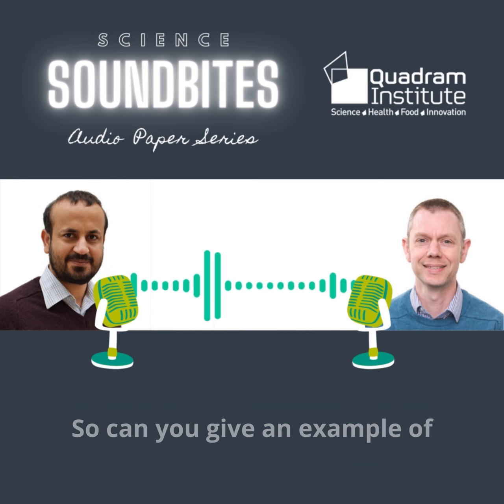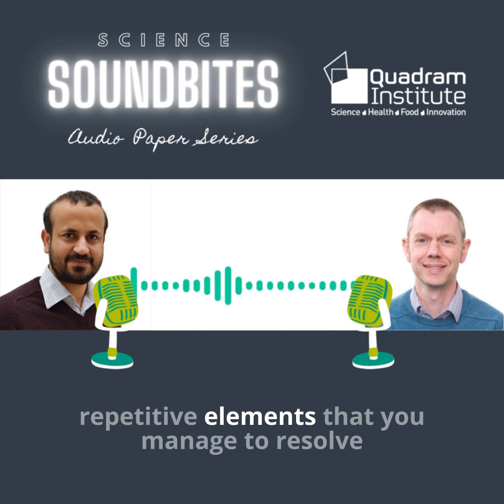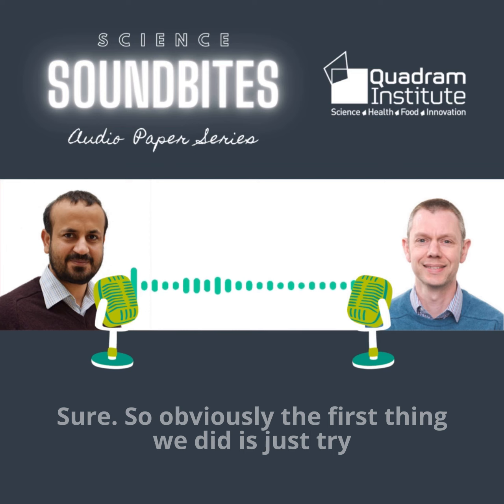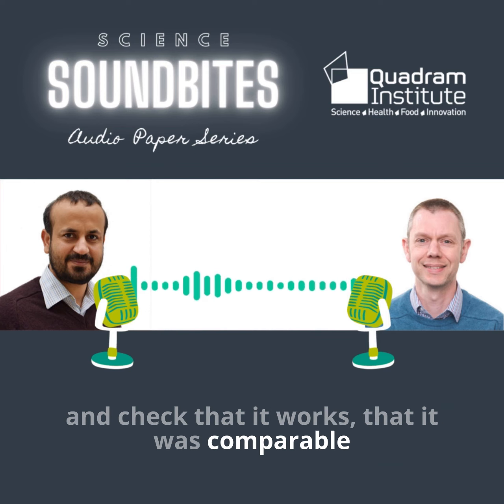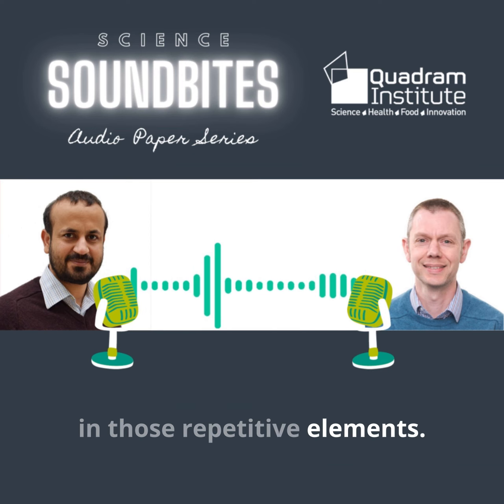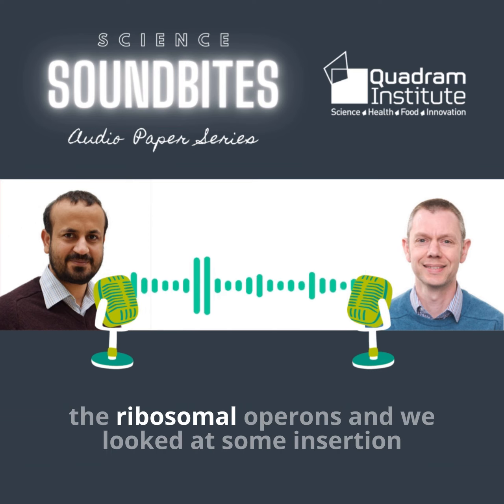Cool. So can you give an example of repetitive elements that you managed to resolve by using this long read sequencing method? Sure. So obviously the first thing we did is just try and check that it works, that it was comparable to the previous data for most genes. But of course, we're interested in those repetitive elements. So we looked at some of those. We looked at the ribosomal operons, and we looked at some insertion sequences.